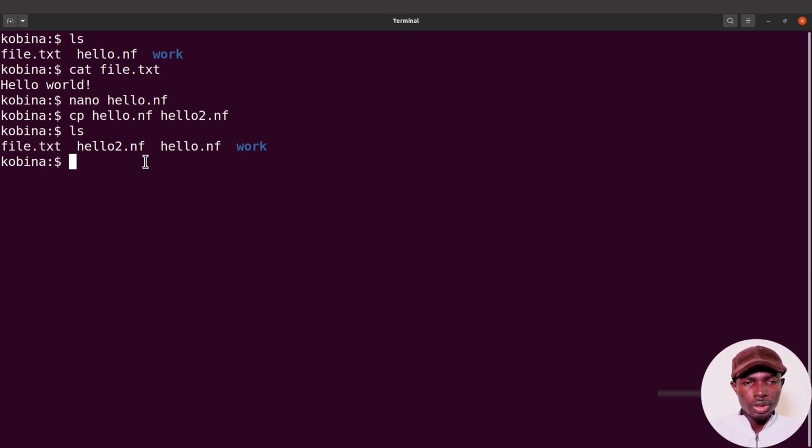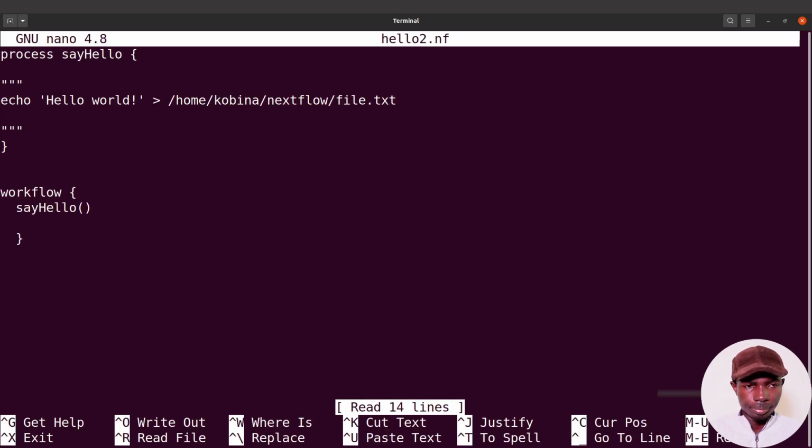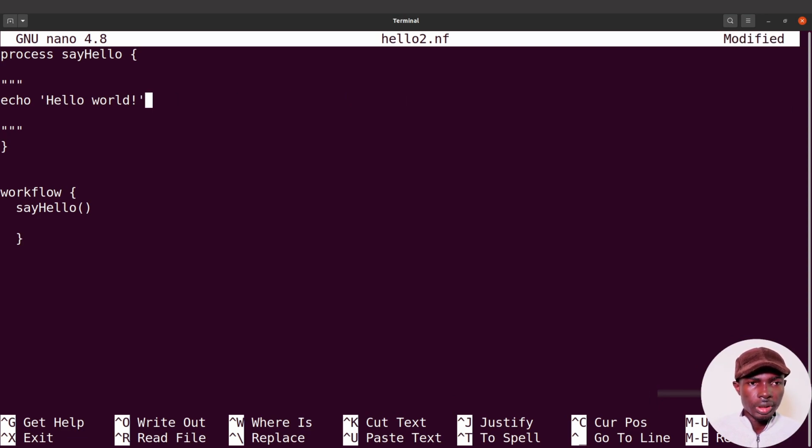All right, so let's do this. Let's edit the hello2.nf, and then we are here. If we want to display on the screen, then that means we don't need these ones here. We don't need them.